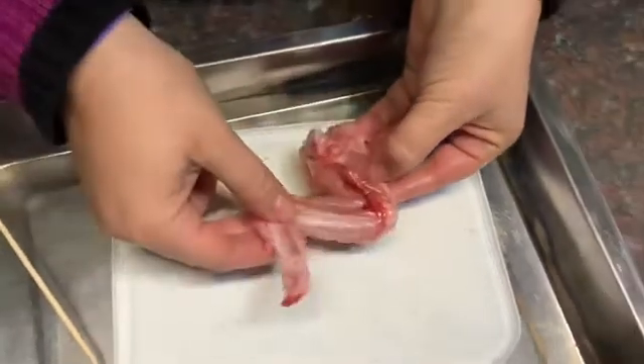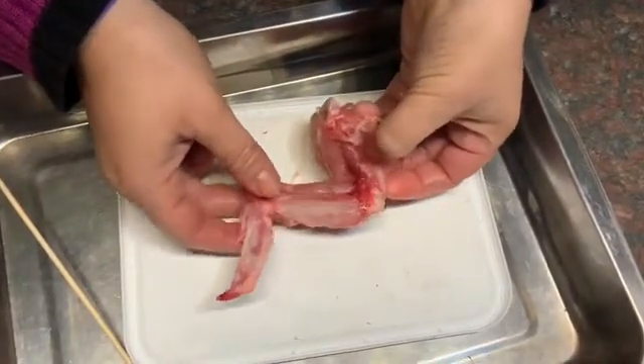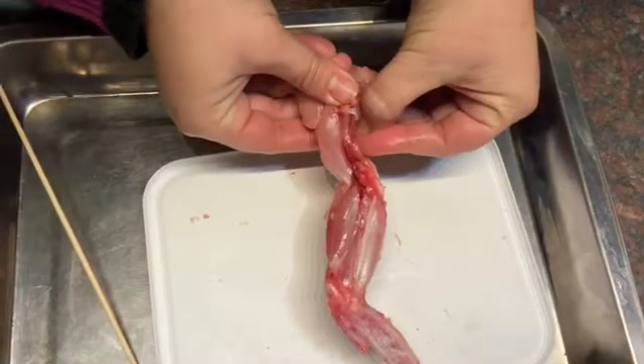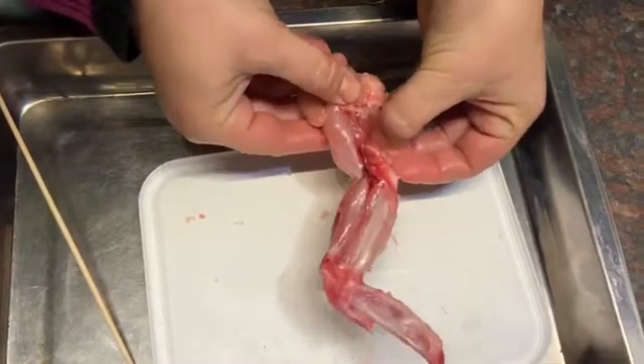If I pull that down again and then grab this muscle with my hand and pull, there you can see it straightens the wingtip nicely.